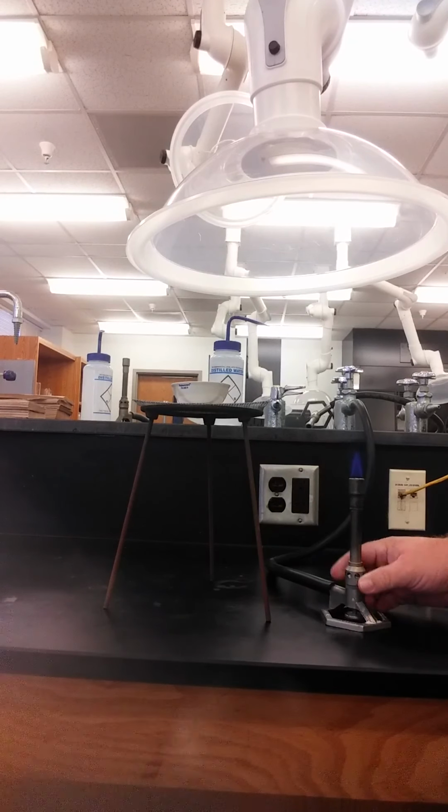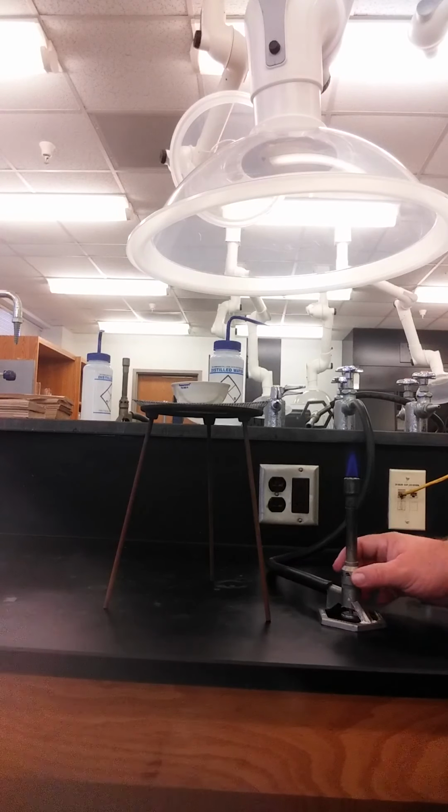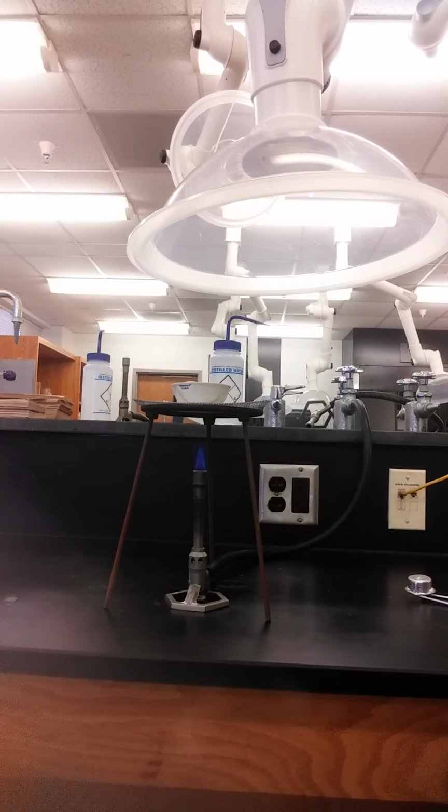Once the burner is lit, turn the gas flow valve and rotate the barrel to generate a bright blue flame. Carefully slide the burner under the tripod.